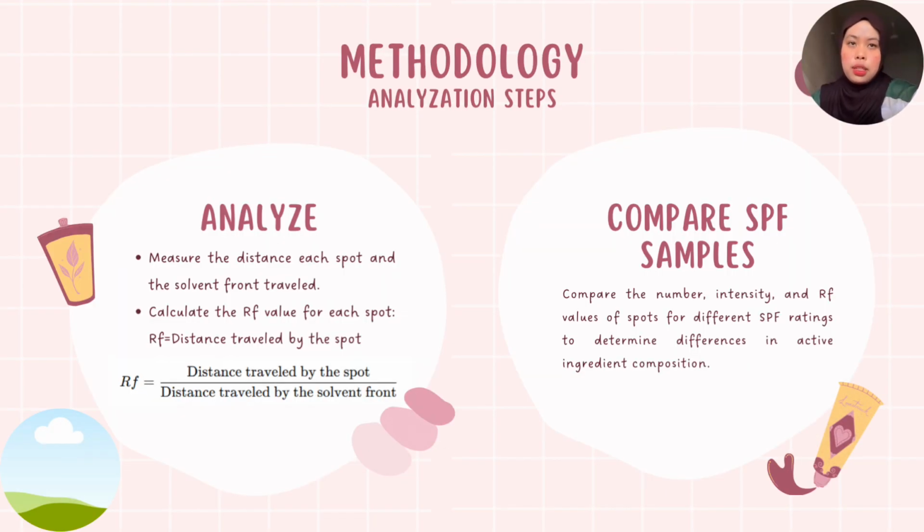The last step is analysis steps. First is analyze. Measure the distance each spot and the solvent front traveled. Calculate the RF value for each spot, which is RF equal to distance traveled by the spot.